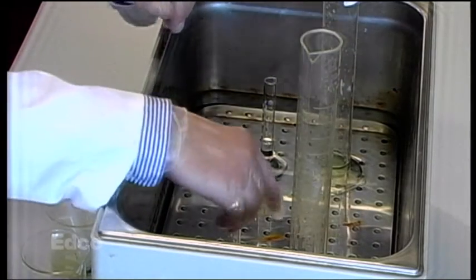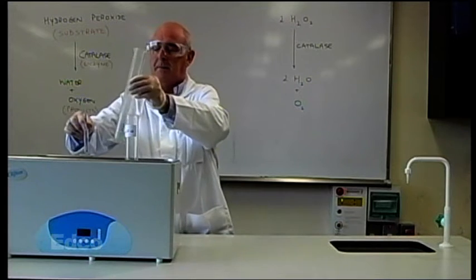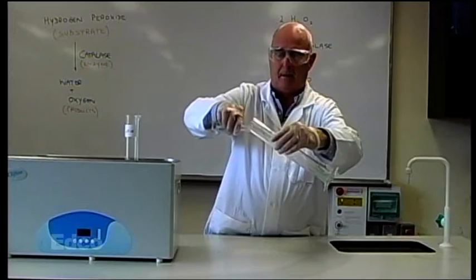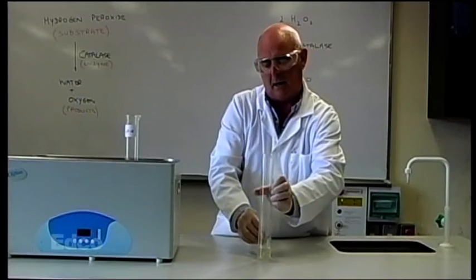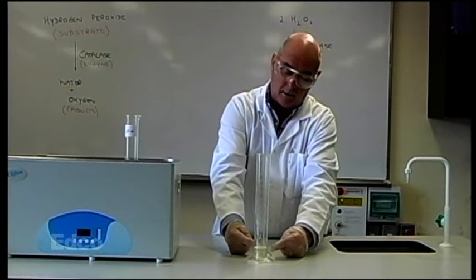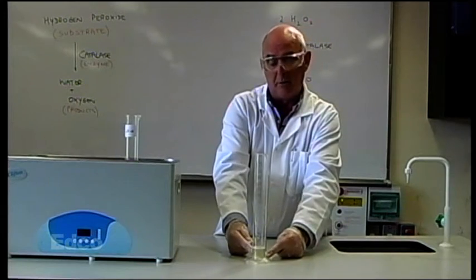After 10 minutes in the water bath, we remove the boiled enzyme and the hydrogen peroxide. And we mix the peroxide, being the substrate, into the boiled enzyme. And no foam is produced. Because of the high temperature, the enzyme is denatured, it has lost its shape, also lost its function, doesn't work. No bubbles, no foam produced.